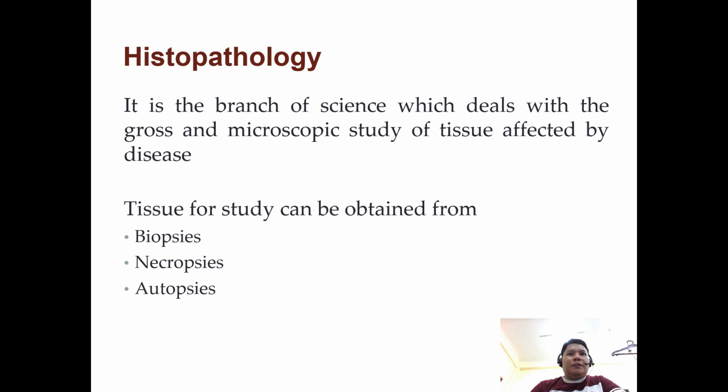The study of tissues can be obtained from different means. We can obtain in clinical, like fine needle biopsy, or you can have an excisional biopsy, and by taking the excisional biopsy, you have to get the normal and the abnormal tissue.